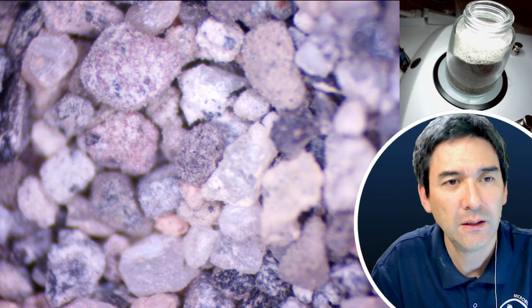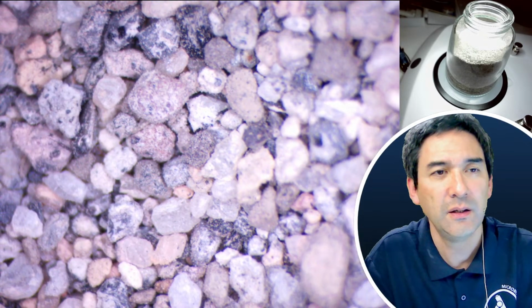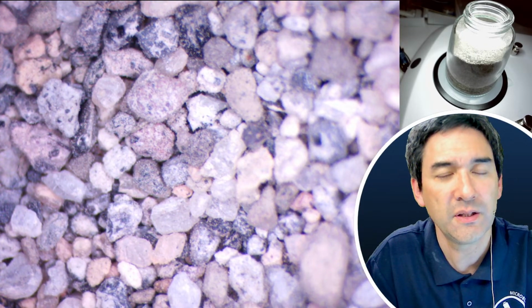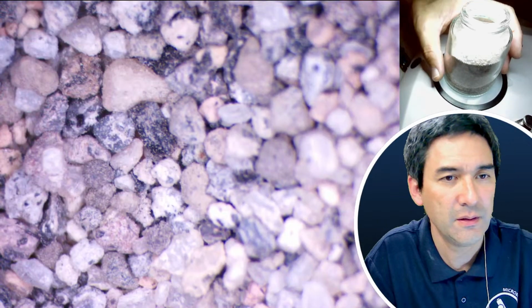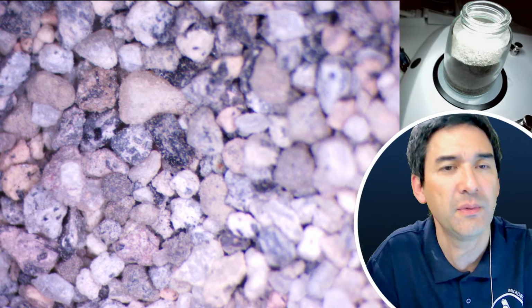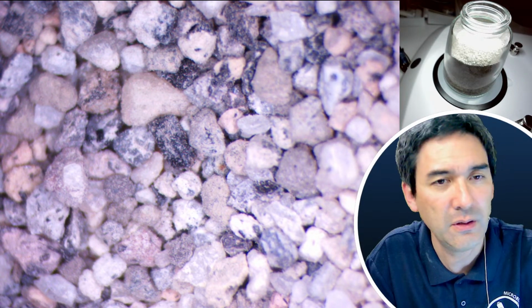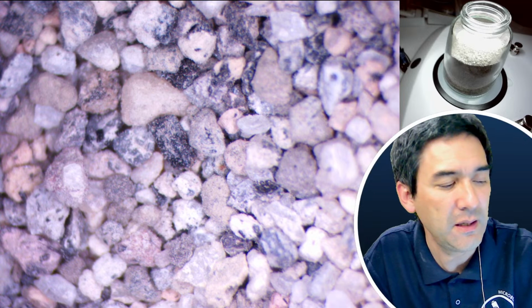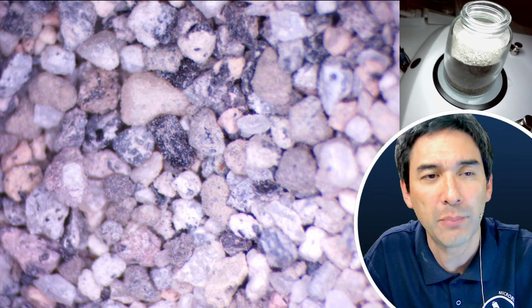Look at this. This is also interesting. It looks very dusty, so this means that there must have been some silt or some other things mixed into the sand. So maybe I could improve the image a little bit by taking a small sample and giving it a little rinse to rinse away the smaller particles.